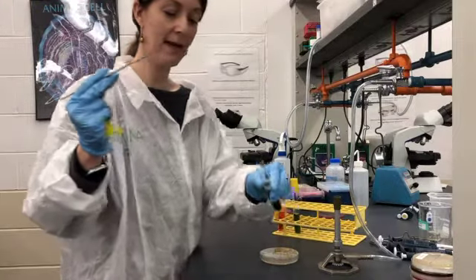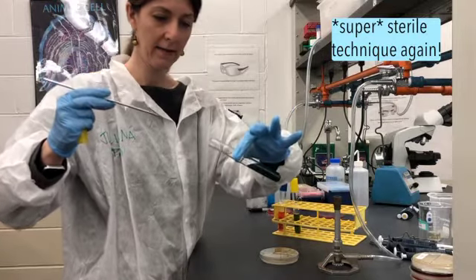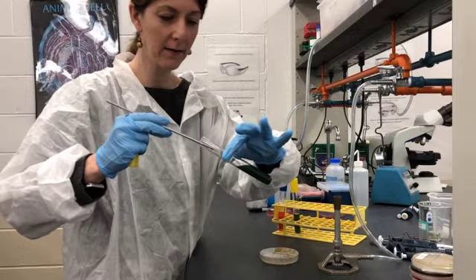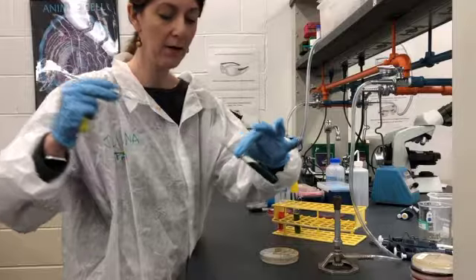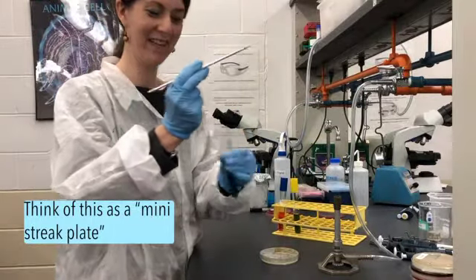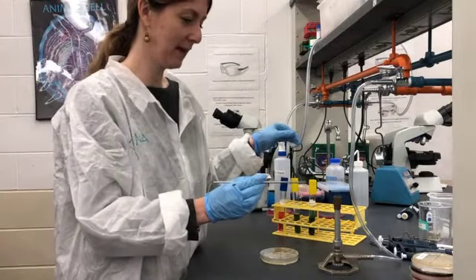I'm going to flame that, keep it at an angle. And then, this might be hard for you to see, but I'm going to start with a zigzag pattern, starting with the bottom and moving my way up. And maybe go back and forth, maybe 12 or 15 times. Flame. And now that media has been inoculated.